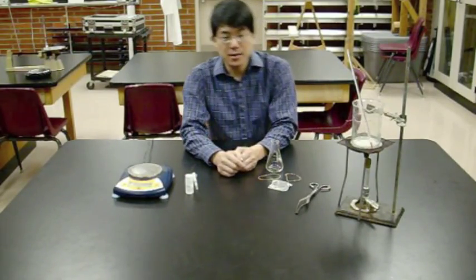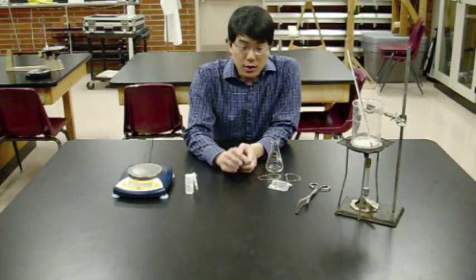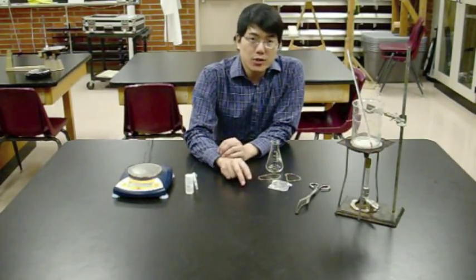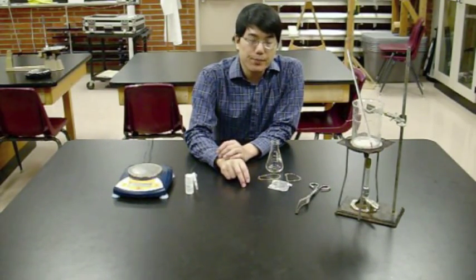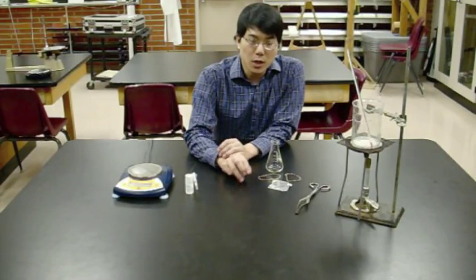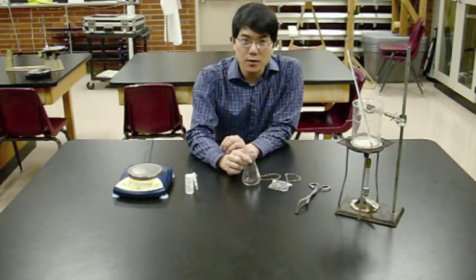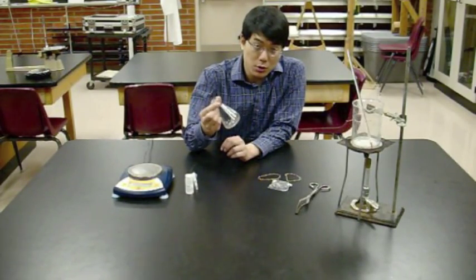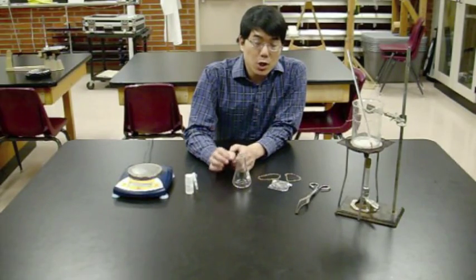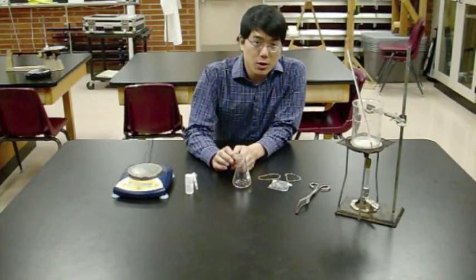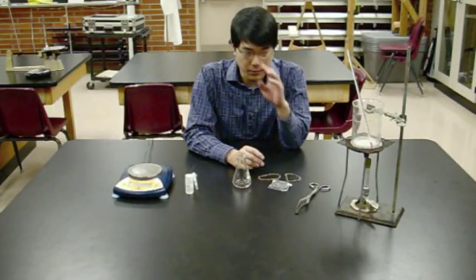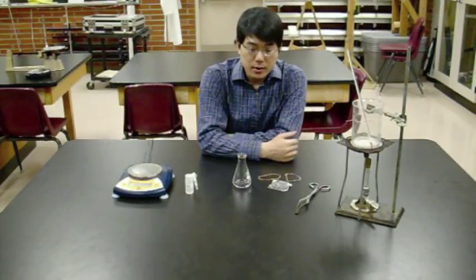The lab is divided into three parts. Part one measures the mass of the unknown vapor. Part two measures the density of tap water. Part three uses the same tap water to measure the volume of your 125 milliliter Erlenmeyer flask container. You must do part one first. You can do parts two and three simultaneously, but do part one first.